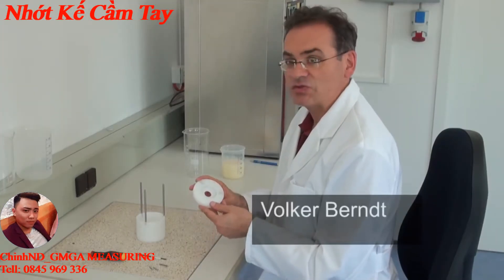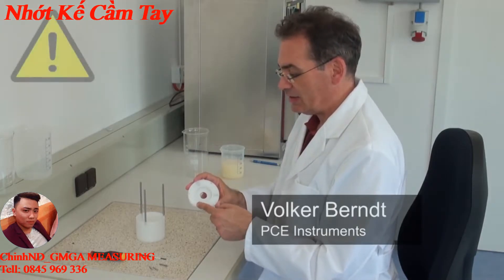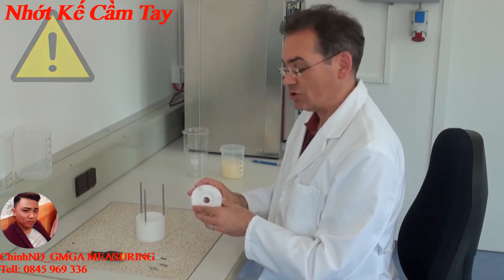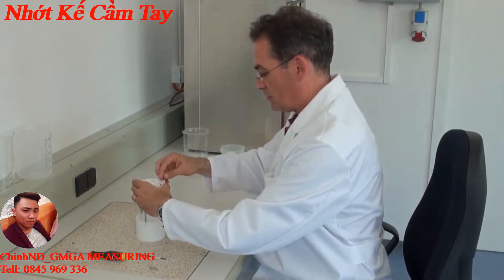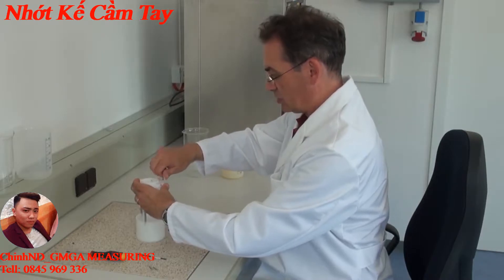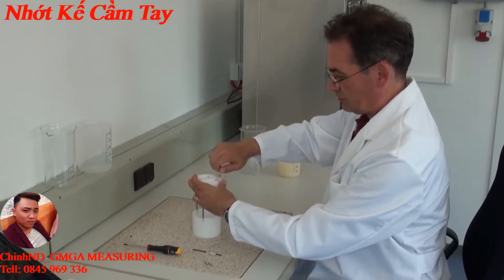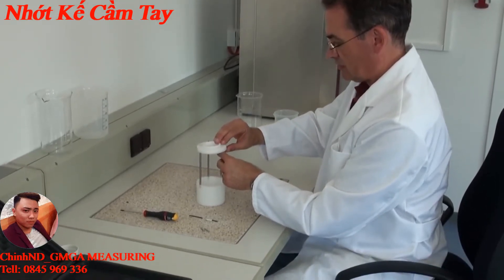Now the lid of the protection cage is screwed on. Here it is important to watch that the groove of the lid shows upwards, because later the viscosity meter is attached here. I put the lid on now, putting the screws into the threaded rods and tightening them. I do this three times with each rod.